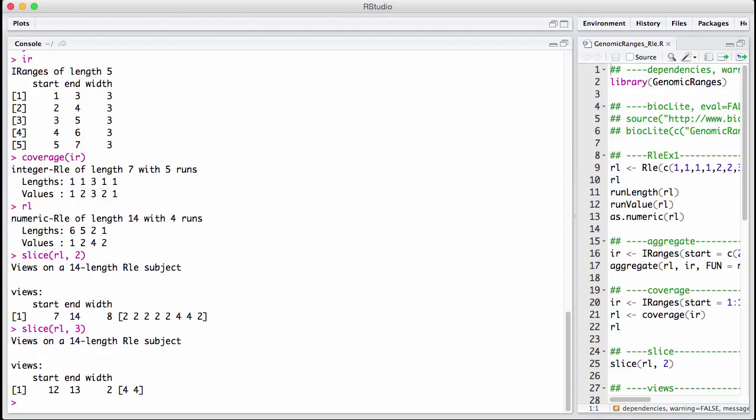And this is completely the same, and in a way exactly the same, as the views object we have discussed for BS genome objects. So we have one potentially very big object, which is the run length encoded vector. Think about vectors across the entire genome. And we basically have indexes or intervals with subsets, this very long vector. And we do that using this views constructor. But now instead of having a view on a genome, we have a view on a run length encoded vector.